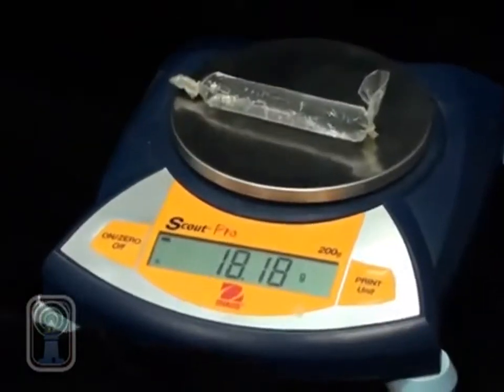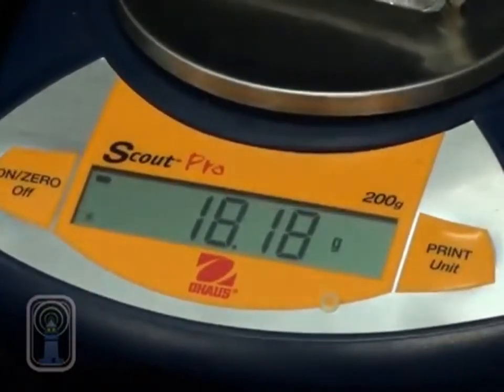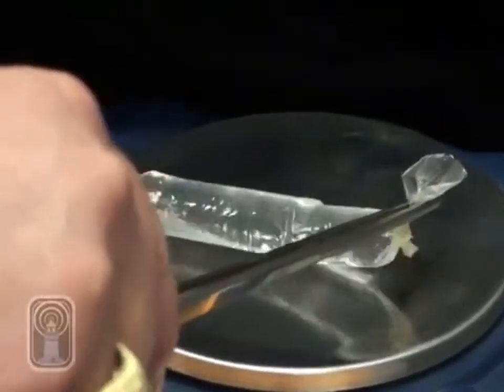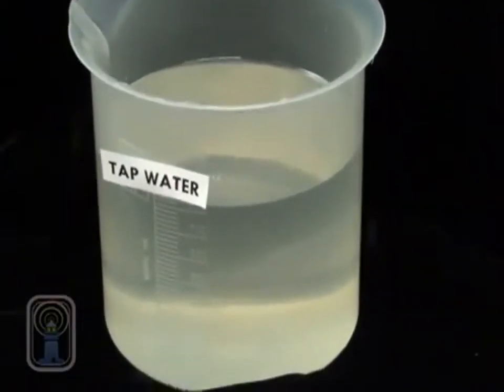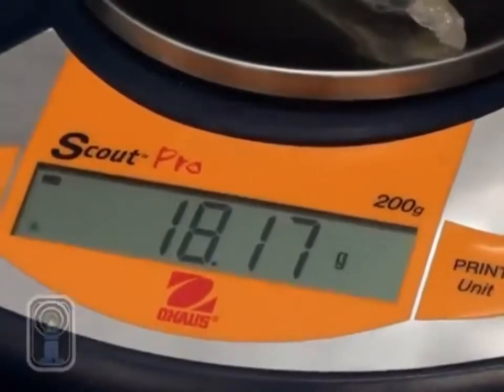In this demonstration, a cell was again formed from the dialysis tubing and was filled with tap water. After both ends of the cell were securely fastened, this cell also was weighed on a digital balance. The cell was placed in a beaker of tap water for half an hour. As you can see, the weight of the cell remained constant.